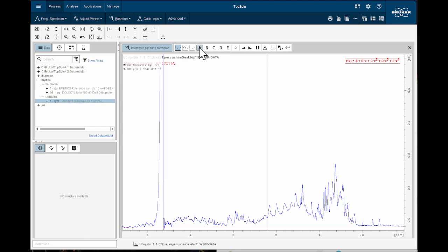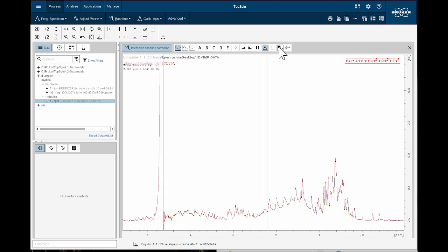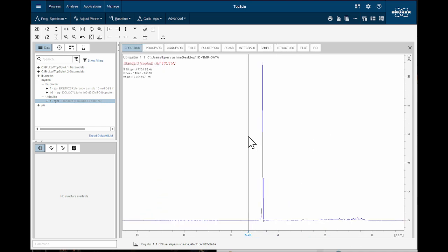So now I can move it. First I will align it with the left side, and then you can see it's just a bit ahead, so I lift it up. So now my baseline adequately represents the noise floor. So I delta it and save.